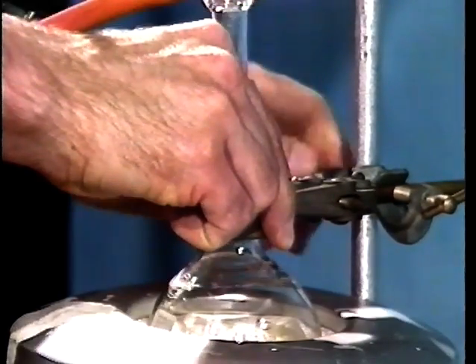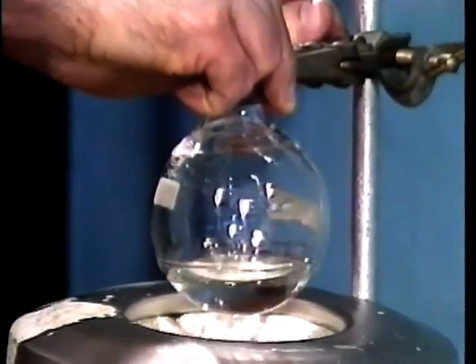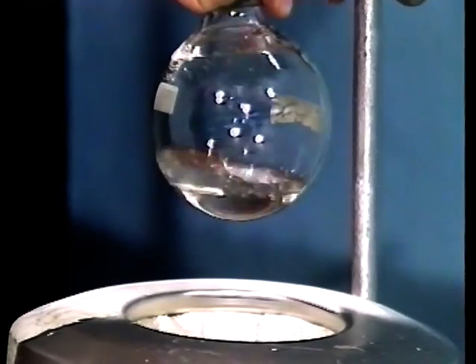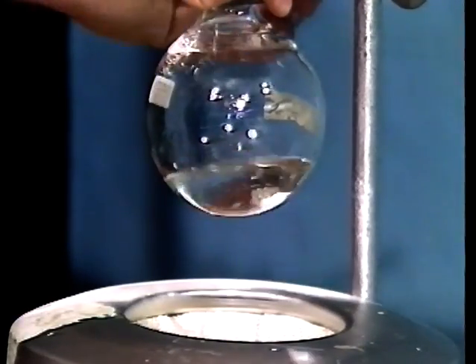Bring the solution back to the boil and observe whether the solid has gone into solution completely.